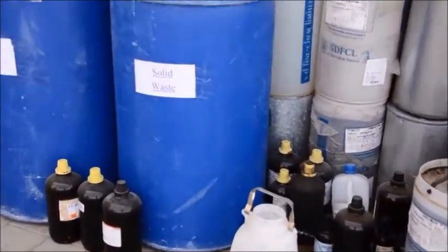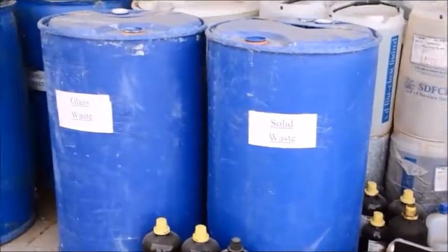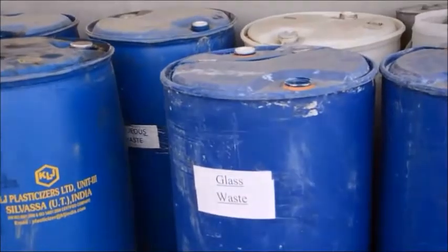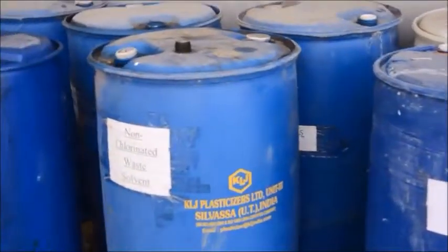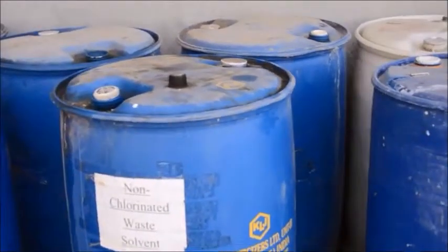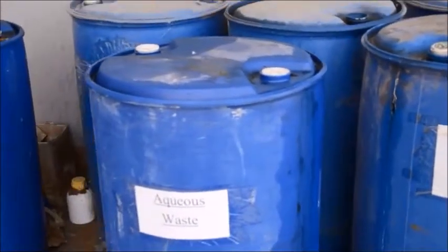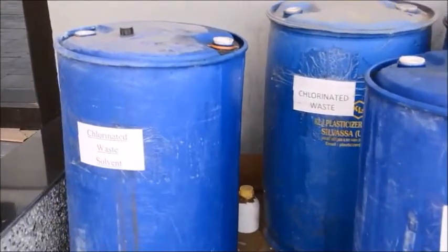Here at IIT Gandhinagar, proper disposal has to be taken care of, keeping in mind the climatic conditions. All solvents have a boiling point. The summer heat here makes them evaporate directly into the environment, making it hazardous not only for human beings but also to the flora and fauna of the immediate surroundings. Also, waste drums should never be filled up to more than 3/4 of the container.